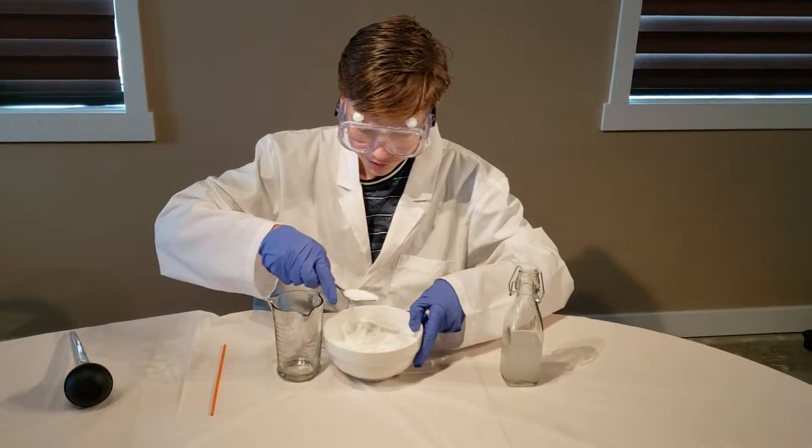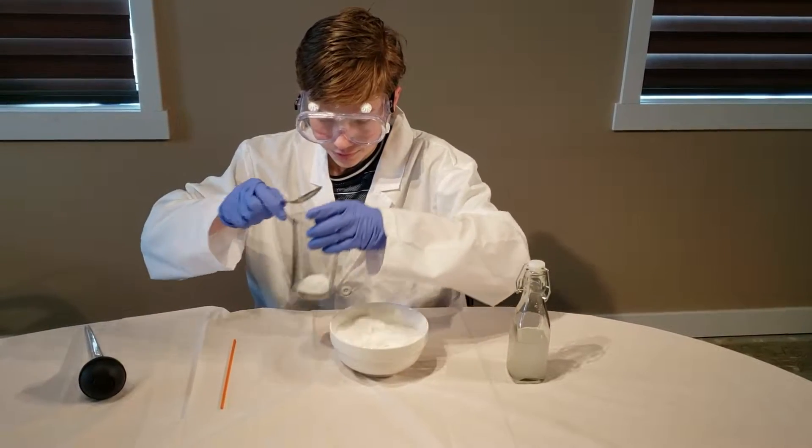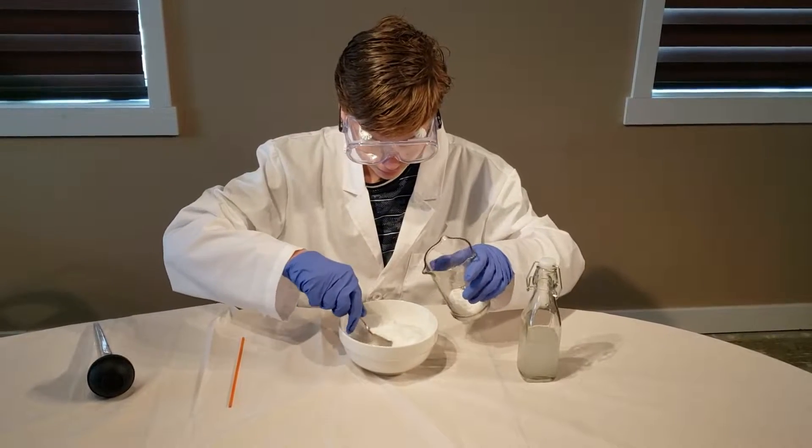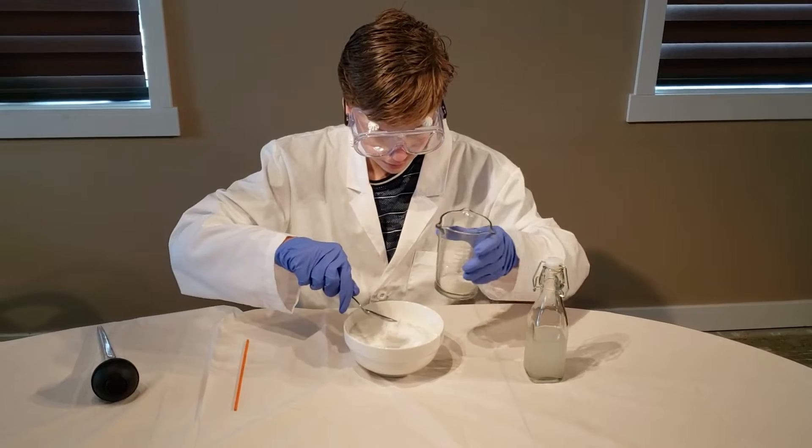As you can see, I am scooping the sugar into my glass container. Make sure that it is a glass container or plastic, not metal. Metal will dissolve.